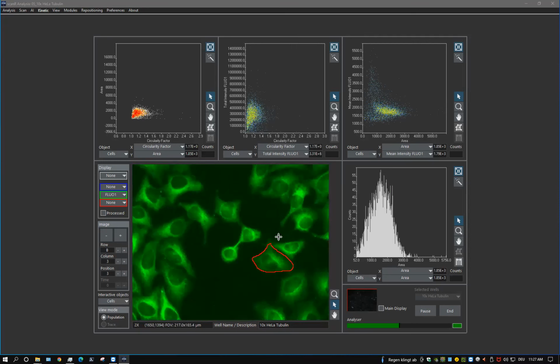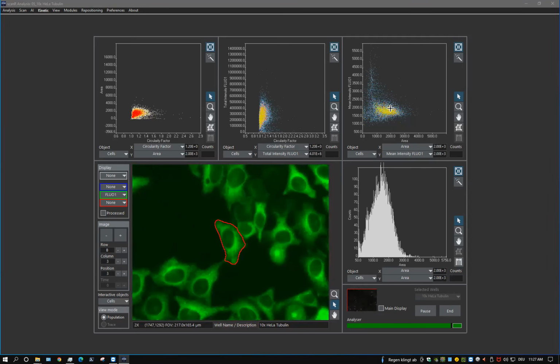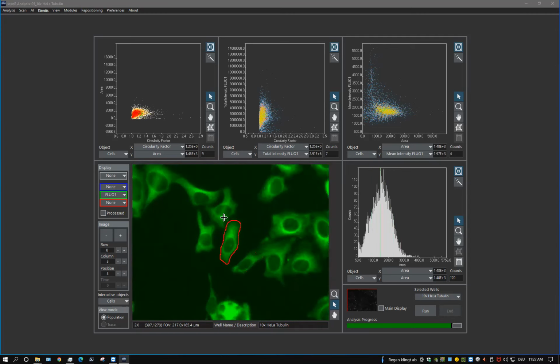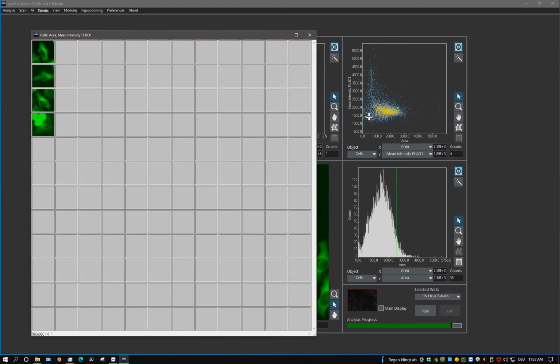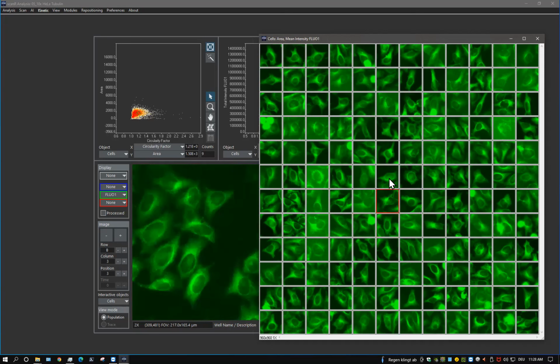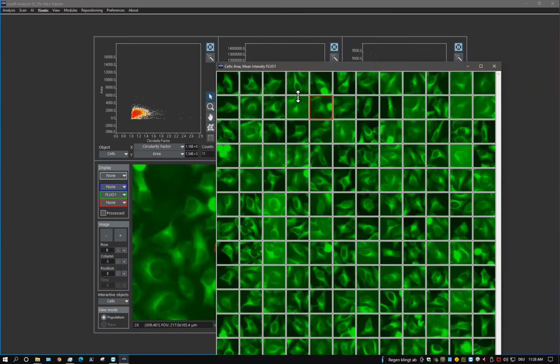And what happens here is, I mean, this is a difficult job for classical image analysis, and there will be no perfect solution. So there is no obvious perfect contour, but what the pre-trained networks deliver here is very close to a perfect contour, I would say. So we can have a look at some representatives of all states here. I can see here that, for example, even in this very noisy part of the sample where probably we had a lot of bleaching due to multiple acquisitions, it finds a very good estimate of the cell shape. I mean, this is not 100% perfect, but I think it's 99% perfect. And this is a very good foundation of a good analysis.